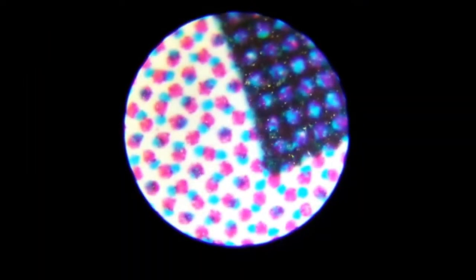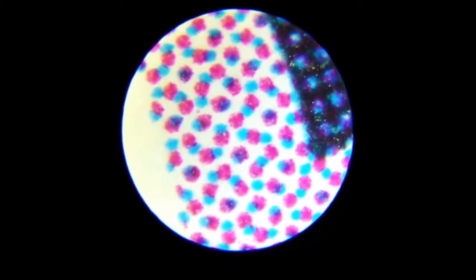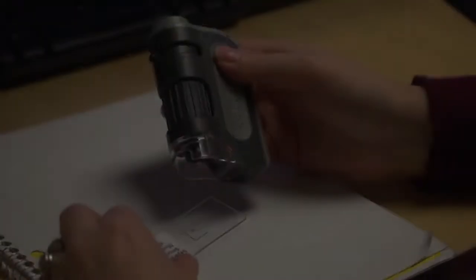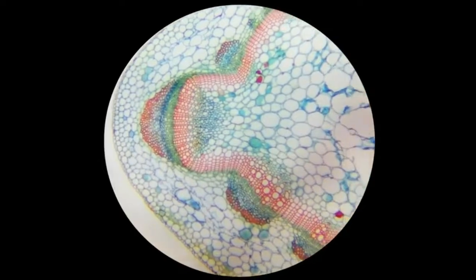Speaking of the lenses, the optical quality inside this is superior to most pocket microscopes out there. It's amazing how simple everyday items can come to life under a microscope. This microscope definitely makes detailed inspection a lot easier. The built-in LED is positioned so you can look at three-dimensional objects or flat surfaces.